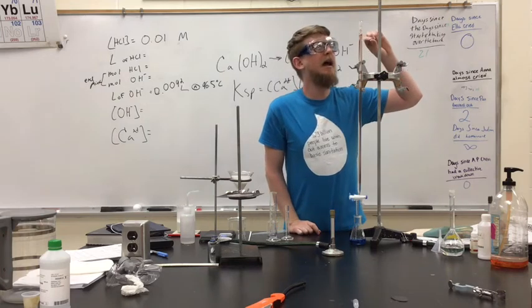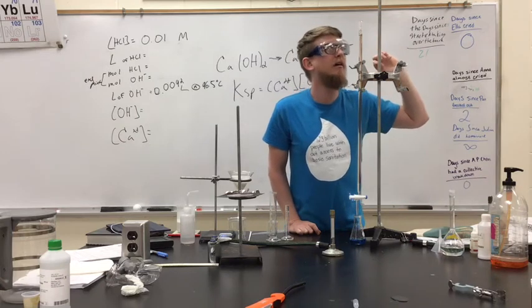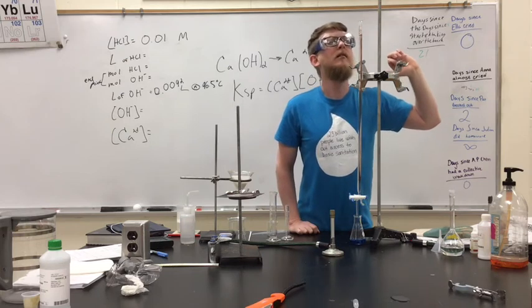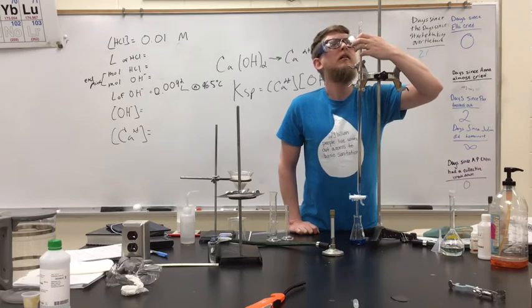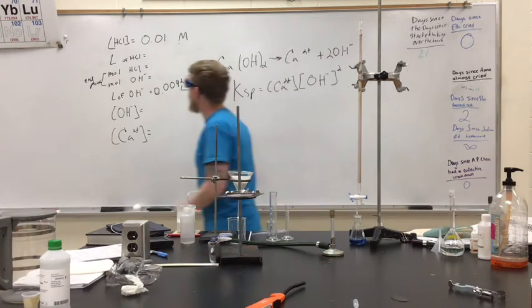We're up here at about 0.7. Make sure that's right. Yep. Let's see, 0.5 is there. No. I think we're more like about 0.6. It looks like about 0.6 milliliters is where we're starting at.